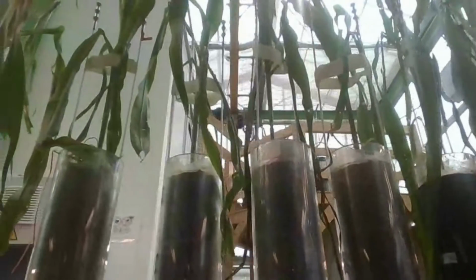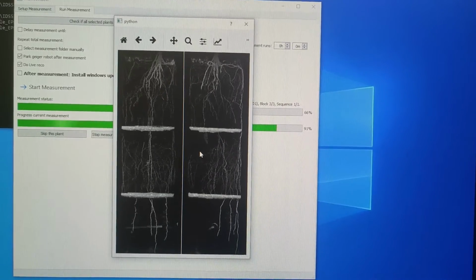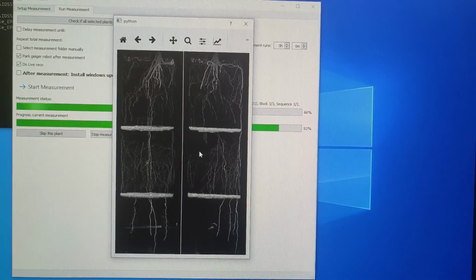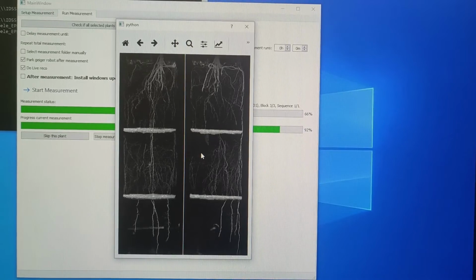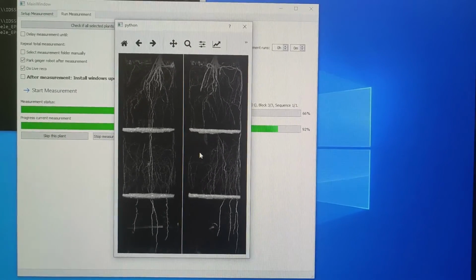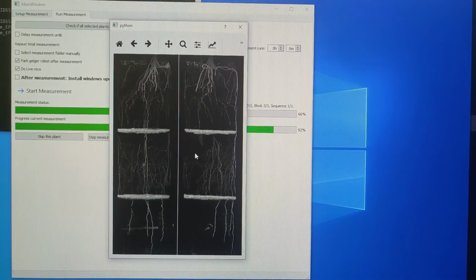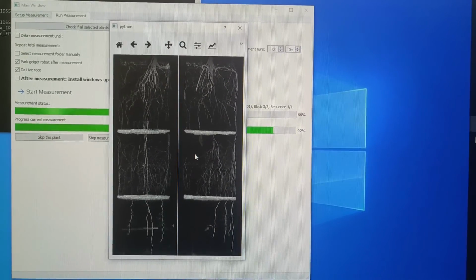However, the experiment can be considered successful in the sense that the hydraulic isolation between layers was maintained. Also, we were able to observe root growth of laterals in the wetter soil areas. Furthermore, the differences in water uptake rates between layers appear to be consistent with the differences in root abundance between layers. However, the occurrence of the reversal of the hydropatterning phenomenon still has to be demonstrated.